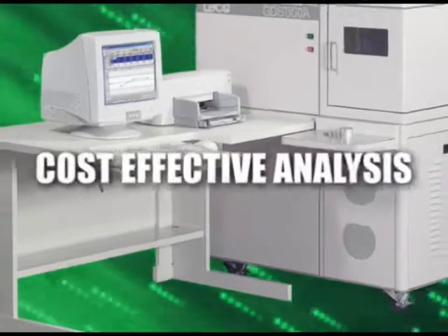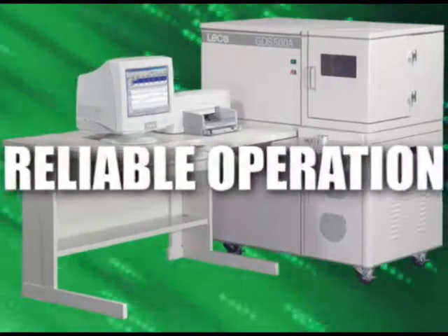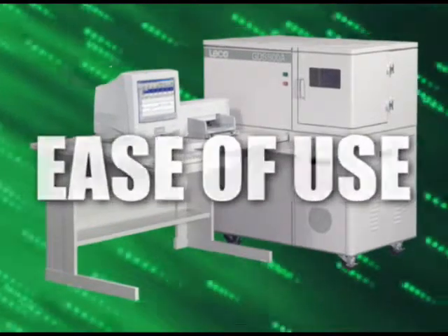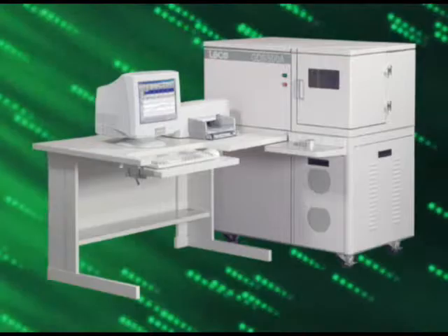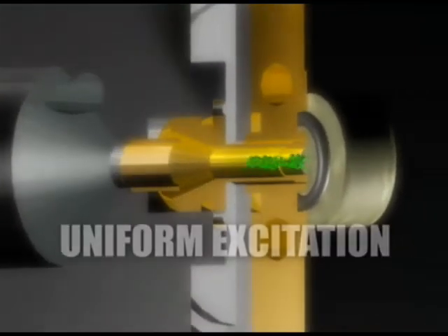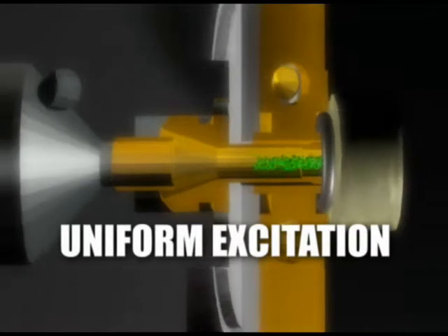The Leco GDS500 will provide your laboratory with cost-effective analyses, reliable operation, durability, and the ease of use that your laboratory requires for routine analyses. The Leco GDS500 offers many advantages in spectrographic analysis, such as more uniform excitation.